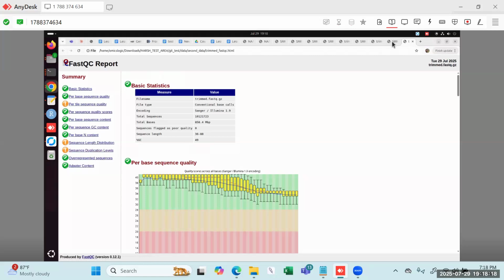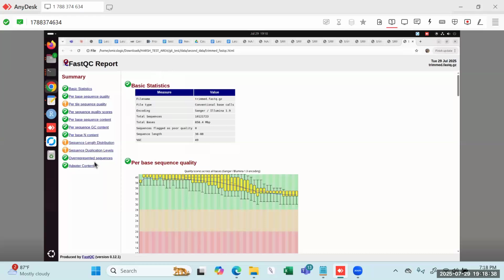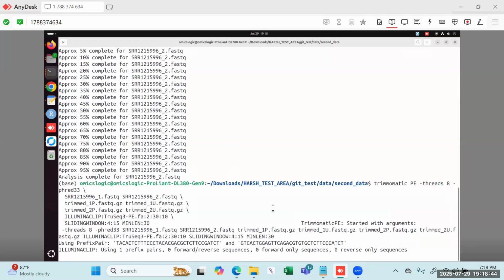And there is the duplication level. If we see, duplication levels are not improved here. That means we can work with the parameters that we have. We can either increase or decrease them, and accordingly we can see that most of the parameters are resolved and they are in the acceptable region. With some of the changes, will this work or not? So this is how we set the threshold for the different files that we have.